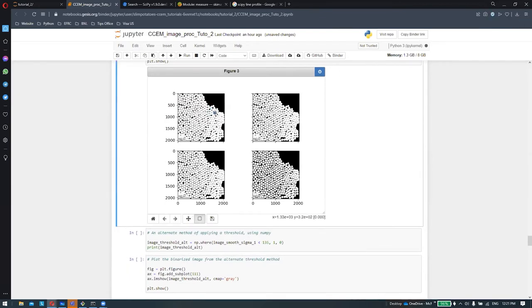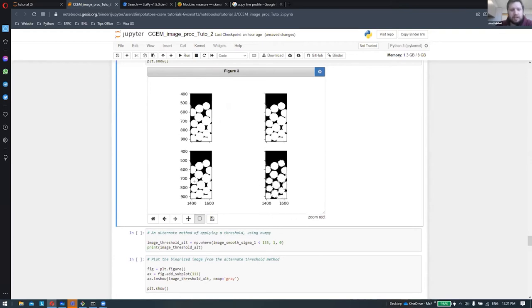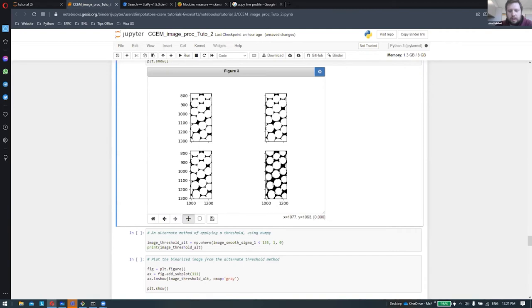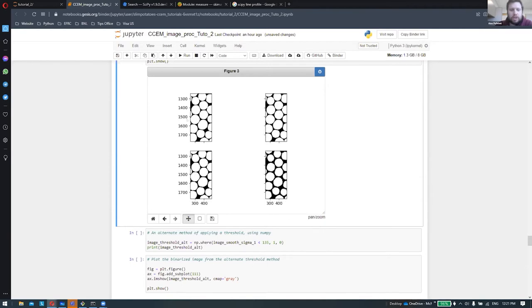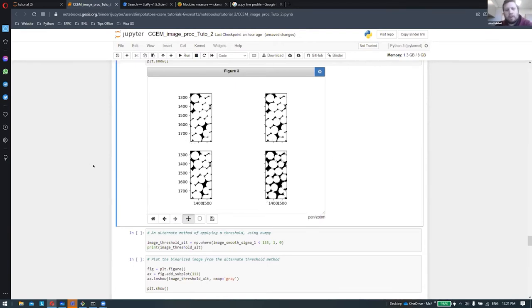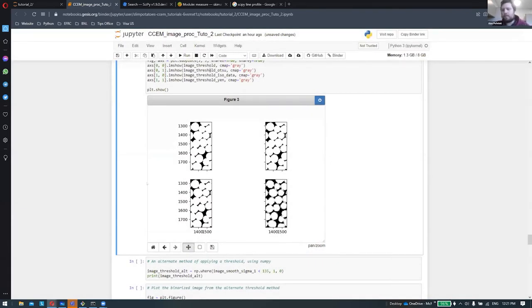Okay, let's go. So we're gonna have a look at those particles here with these different thresholds. As the Otsu and the other one are very similar, like 120 and 114, we don't expect to see that many changes. The main changes will be more on the Yen one, where you have different visualizations here. Typically it will be a choice for you to make which threshold you'll be using for then separating your data. That's why you have to be transparent and say, okay, I used this method to make the threshold, and take the advantages and the inconveniences that you have in both cases.